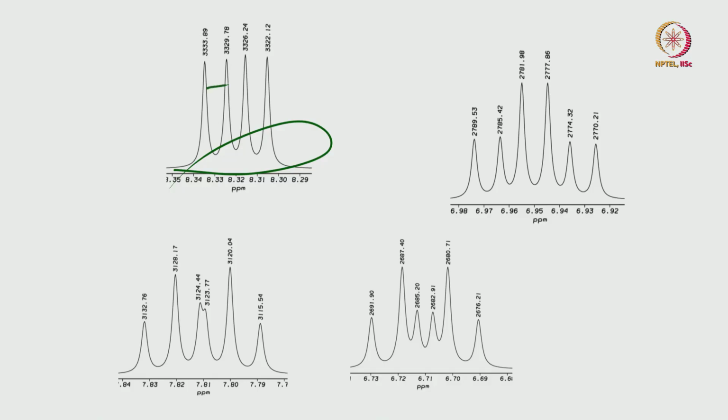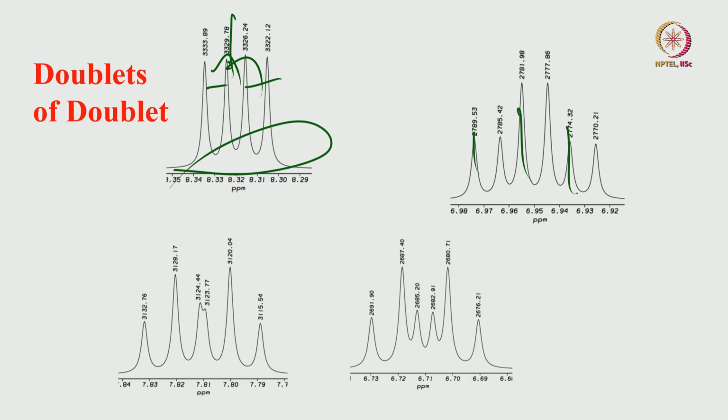For example, this is the spectrum we have got. What do we call that pattern? Two lines, four lines of equal intensity. Obviously, this could be one doublet and another doublet; it does not matter. We call this a doublet of doublets. What about this pattern? Looking at it, we already saw the stick plot. This and this will be one triplet, this and this will become another triplet, and this will be a doublet. So what do you call that?